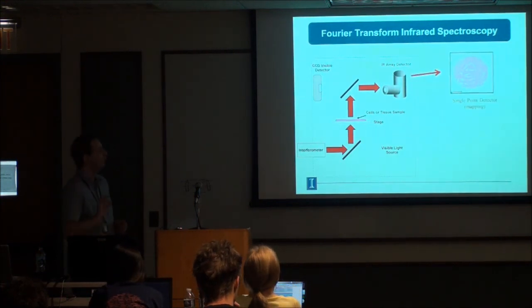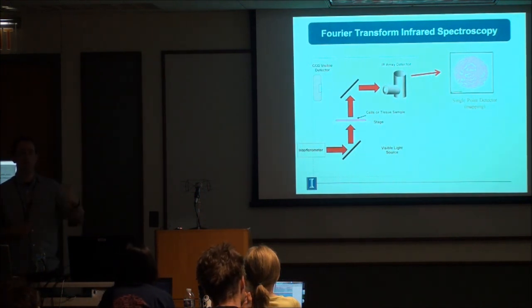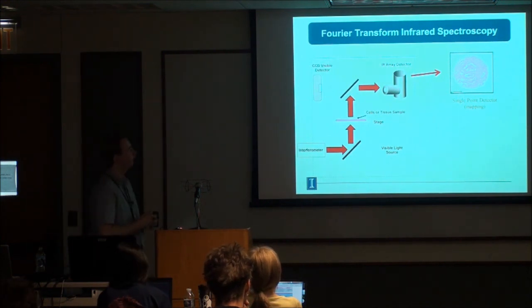So I want to talk first about the single point mapping and then show you the advances and give you a history of IR and how it's led to a lot of the bio applications, certainly from my perspective.